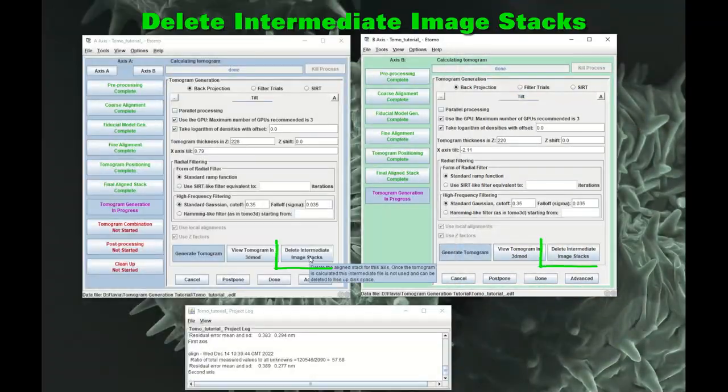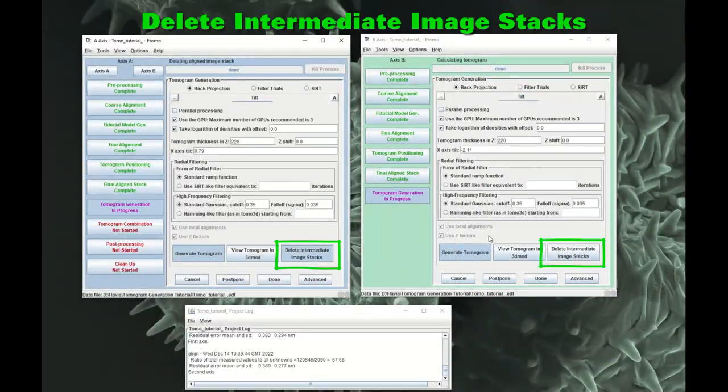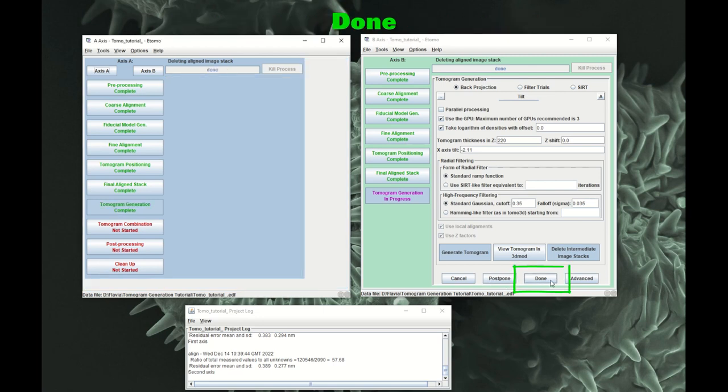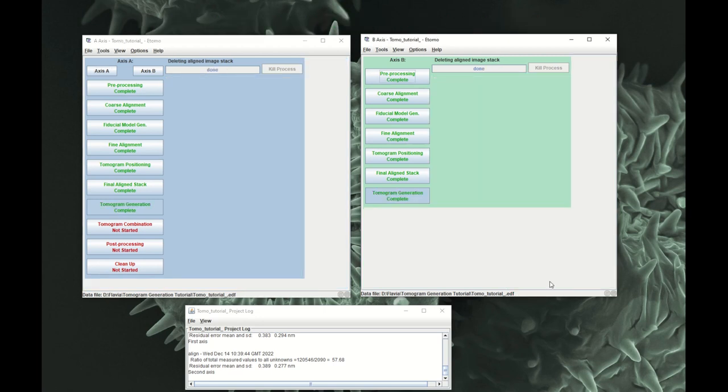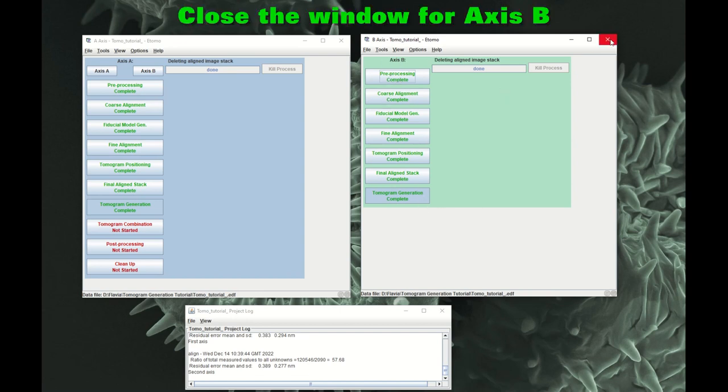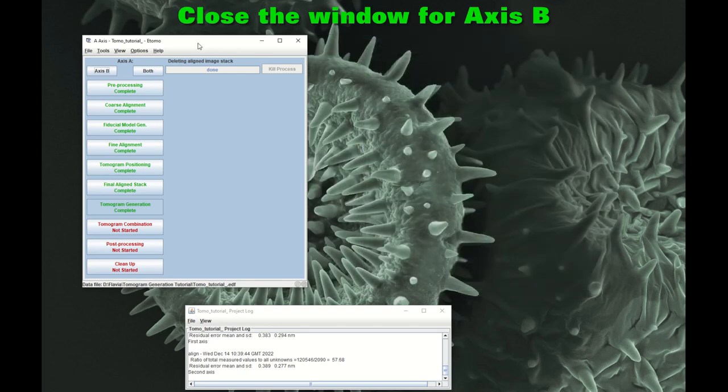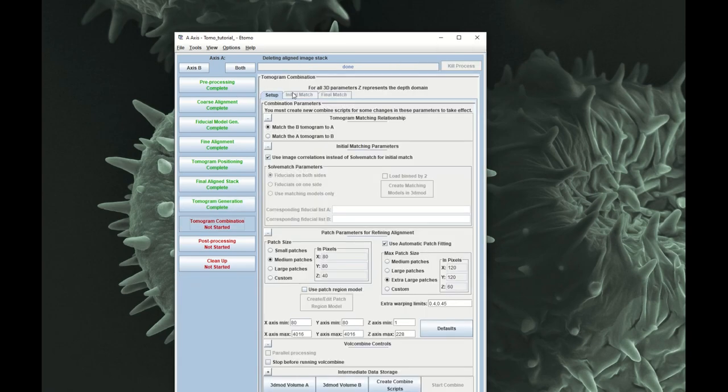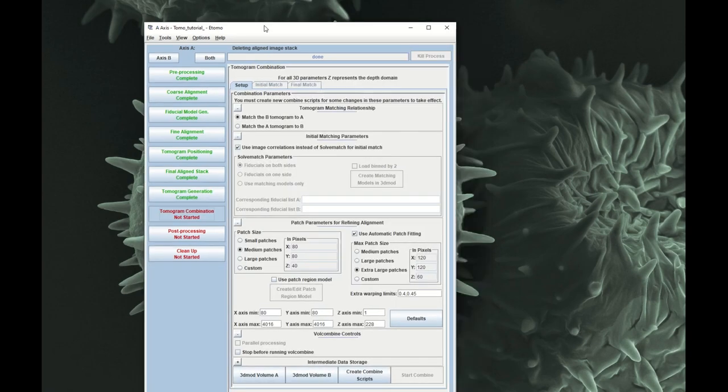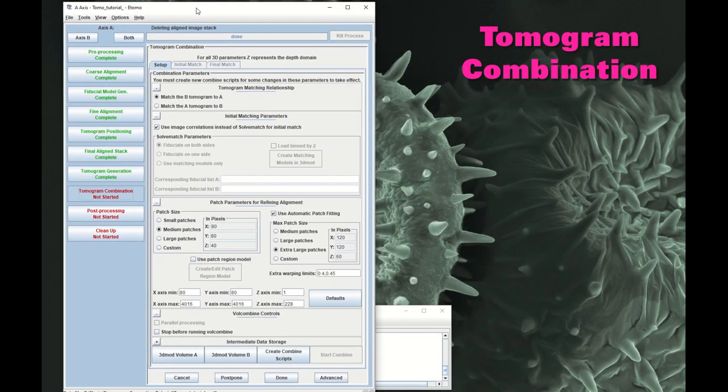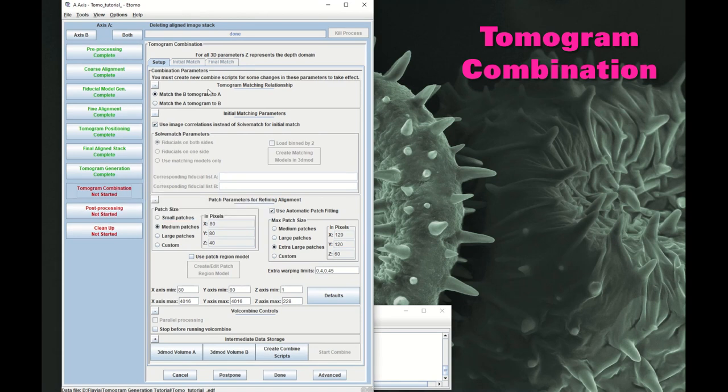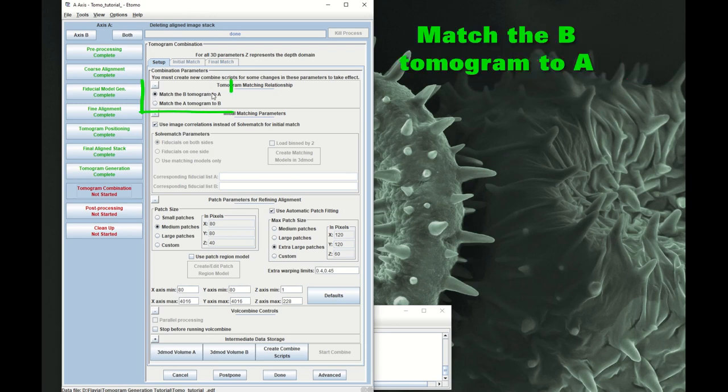So now delete intermediate stacks and click on Done. Of course at this point when you click Done, you've done everything you could do with the axis B. And you can just close that axis. And then the processing continues with tomogram combination just on the window that was originally axis A. So now we're going to do tomogram combination. So match B to A.